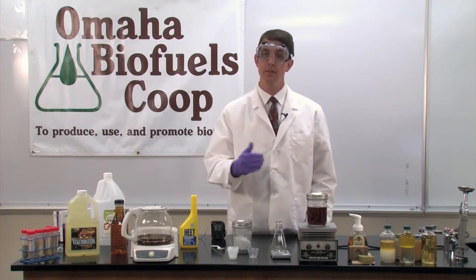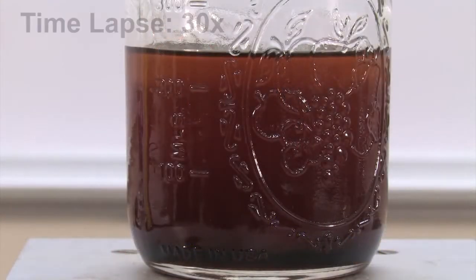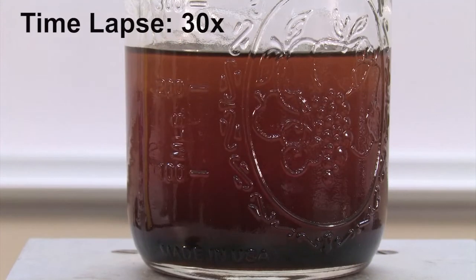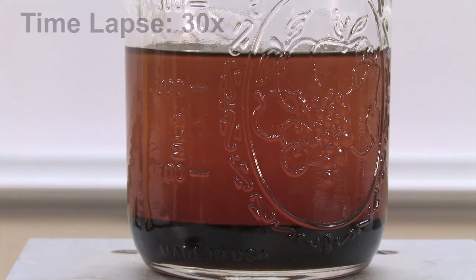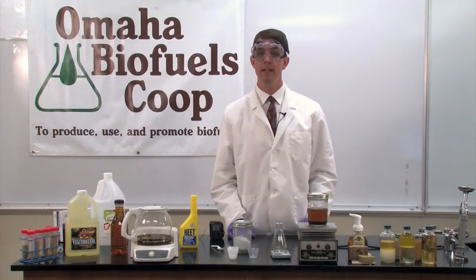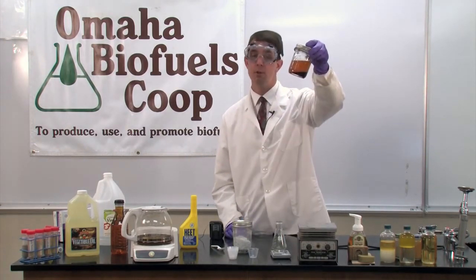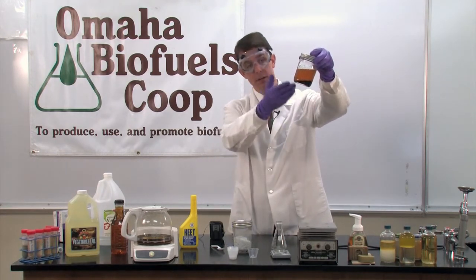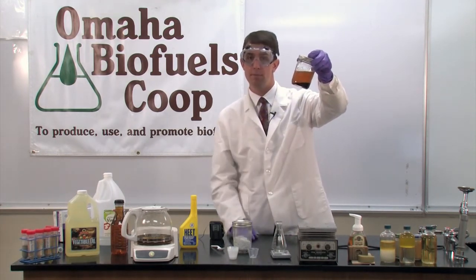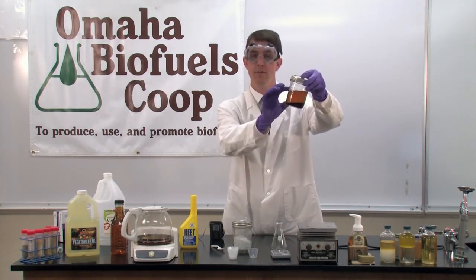We need to let the glycerol settle down to the bottom. Glycerol has had time to separate and settle out of the biodiesel, leaving two distinct layers clearly visible. In about 24 hours settling time, the biodiesel would appear completely clear, and all of the glycerol would be down at the bottom. With a valve at the bottom of the container, we can drain away the glycerol, leaving just the free biodiesel on the top.